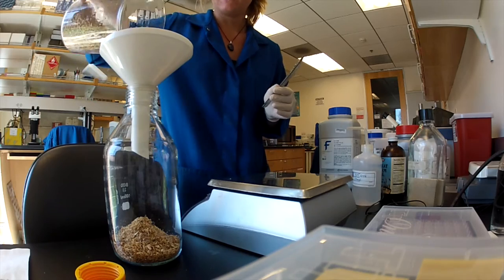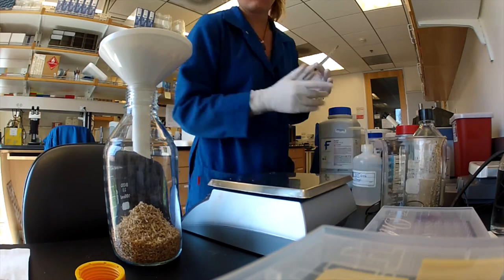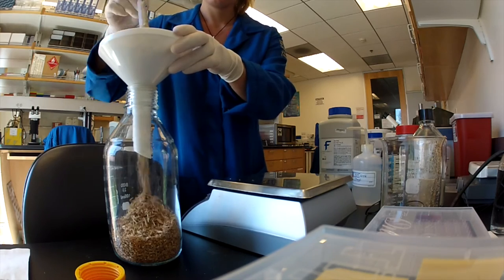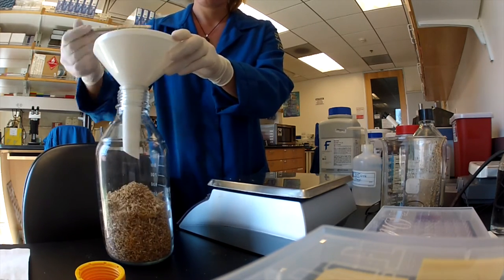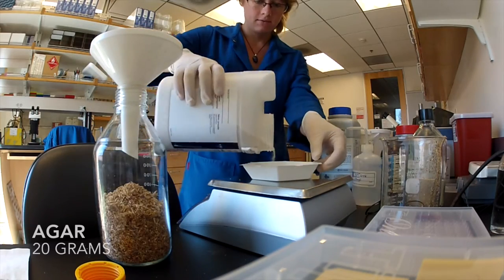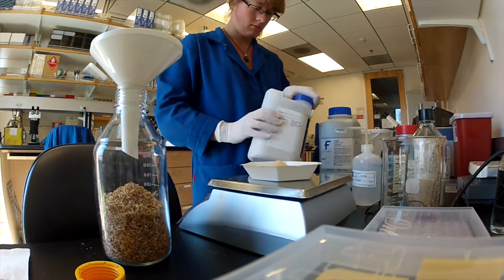Before using it for the diet, we thaw the sawdust for at least 30 minutes. The next ingredient is agar. For one 1-liter batch of diet, add 20 grams of agar.